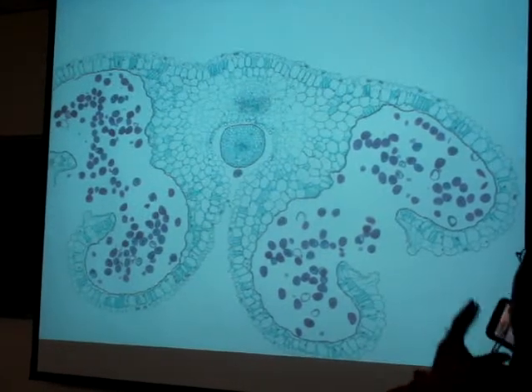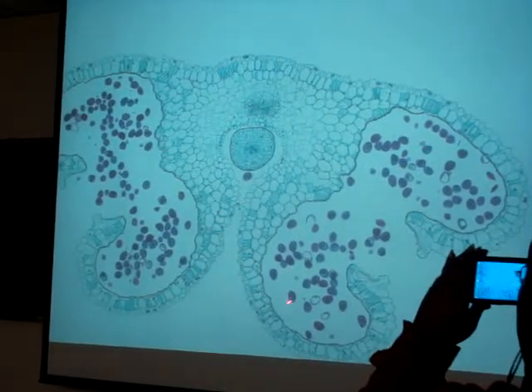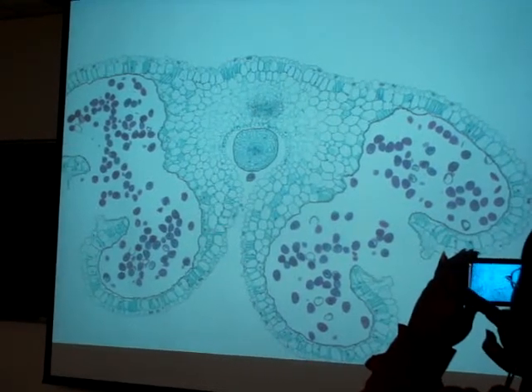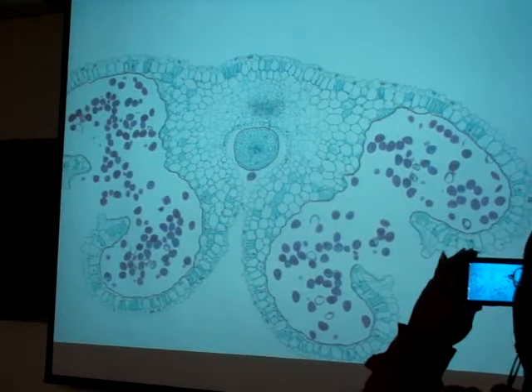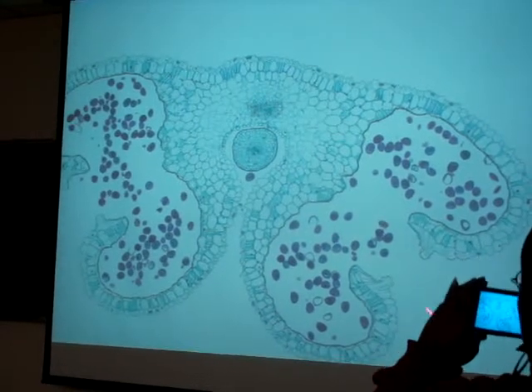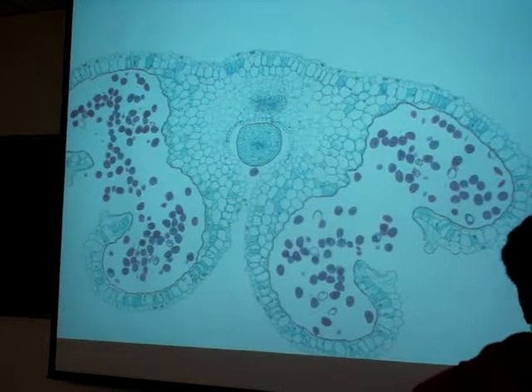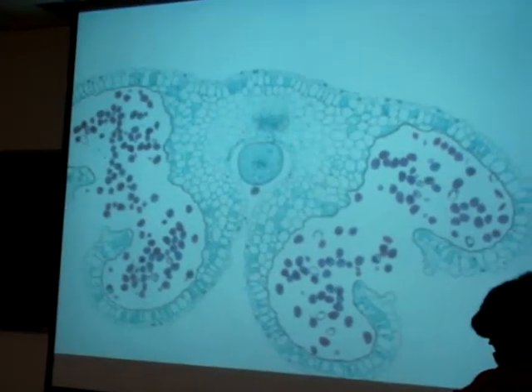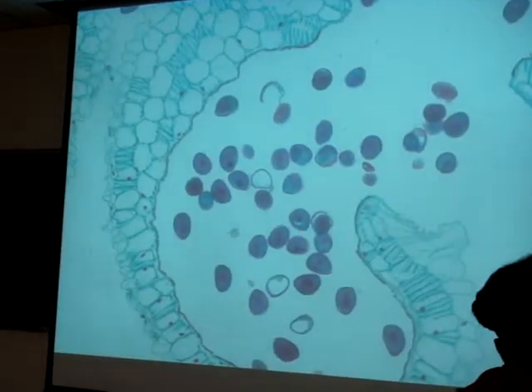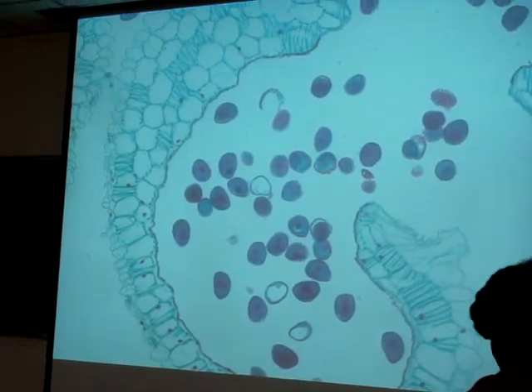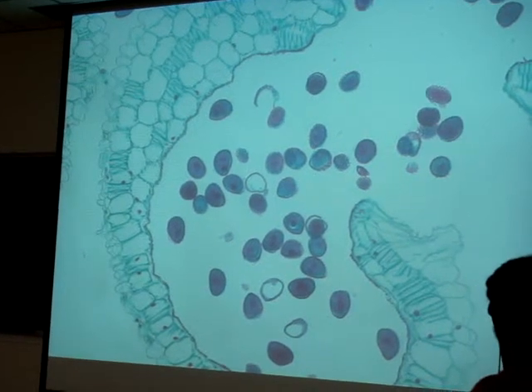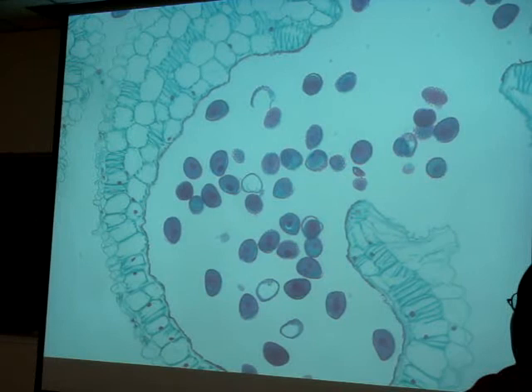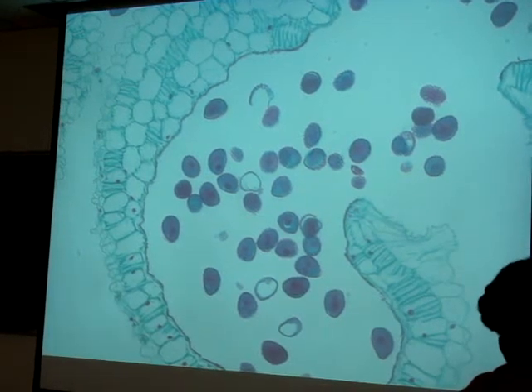Now you're done. What are these things? Or, what else could you call them? Male gametophyte. What are they doing? They're being transported elsewhere. Now you can see a little bit — look over here. You can actually see the two cells. One of them is the tube cell. One of them is the sperm cell, or generative cell, as some people say.